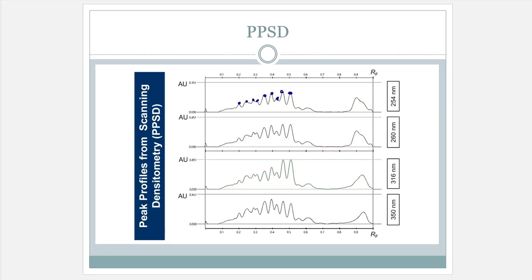I see peaks that are there. I see stuff that's going on. Maybe my developing solvent is causing some absorbance as well, but at least I see different maximums, and that means there are different components and different pieces of the sample that are present. So it is there in a roundabout way. It's not super clean, but I can think of it like a chromatogram.